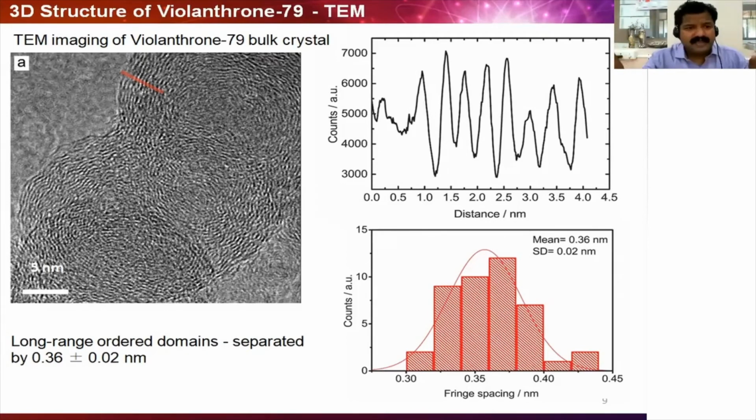So it was sonicated, and because we don't want to dissolve it, we wanted to observe the bulk. So this was fragmented to very fine pieces, and then we focused onto a very flat, very thin, atomically thin slice of this crystal, and then we see this high resolution TEM image, and we can see repeated, periodically arranged structures forming across here.